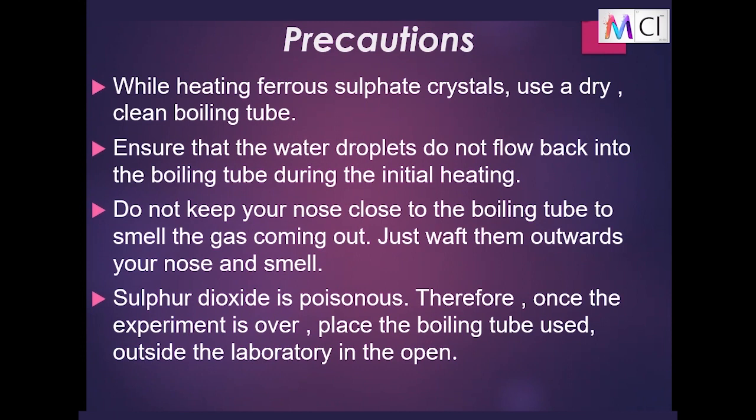Precautions. While heating ferrous sulfate crystals, use a dry clean boiling tube. Ensure that water droplets do not flow back into the boiling tube during initial heating. Do not keep your nose close to the boiling tube to smell the gas coming out. Just waft it outwards towards your nose and smell. Sulfur dioxide is poisonous. Therefore, once the experiment is over, place the used boiling tube outside the laboratory in the open.